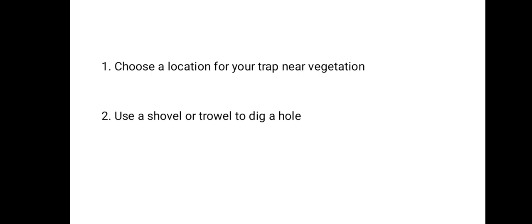You know, most insects move about in vegetations where they find their food, and where some of the insects prey on other insects, and where they also engage in different types of ecological activities within the vegetation. And so when you want to set a pitfall trap, you must locate a place where you have abundance of the targeted insects.